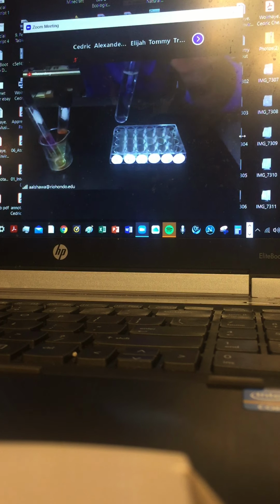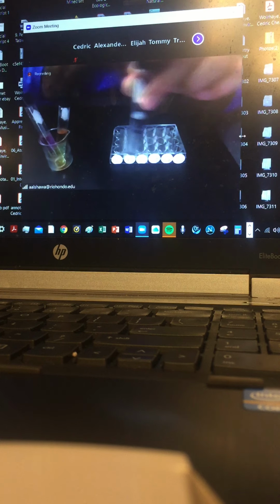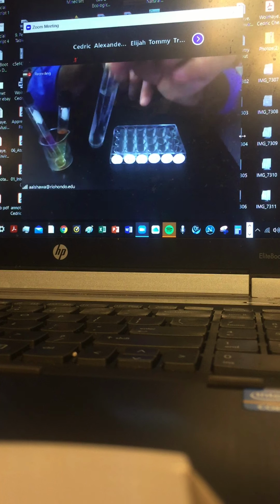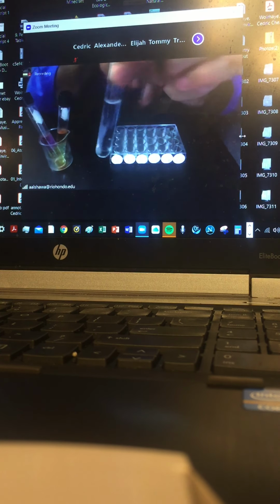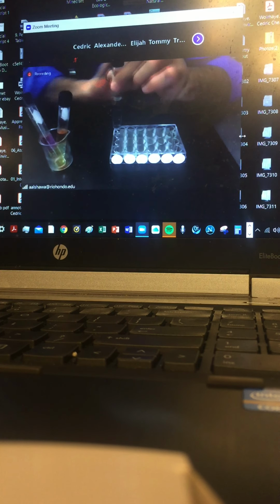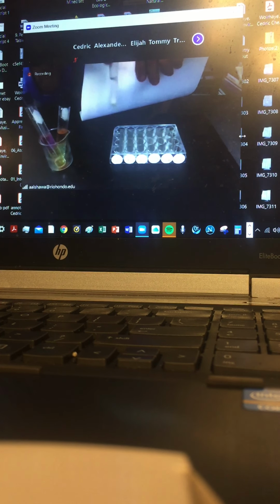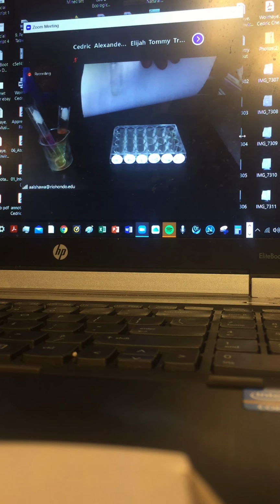So the way it is right now, it's not really happy. That's the reason why the minute you uncap that bottle it is going to escape. Or you can just add organic. So initially I start with a small amount of that chlorine water, but I've added organic. So the color of it, can you figure out if there is any hint of yellow or anything? Hardly, right? So this is what's left of that faint yellow color, hardly any color, either clear or maybe there's a hint of yellowness. Can you see that hint of yellowness somewhere?